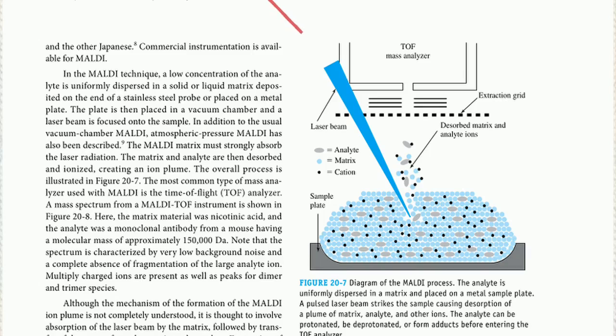This diagram shows the MALDI process. A nitrogen laser hits the solid crystalline mixture with intense light pulses. The matrix acts as a sponge, strongly absorbing that exact wavelength. It evaporates instantly, creating a gas plume where the target molecule gains a positive charge.